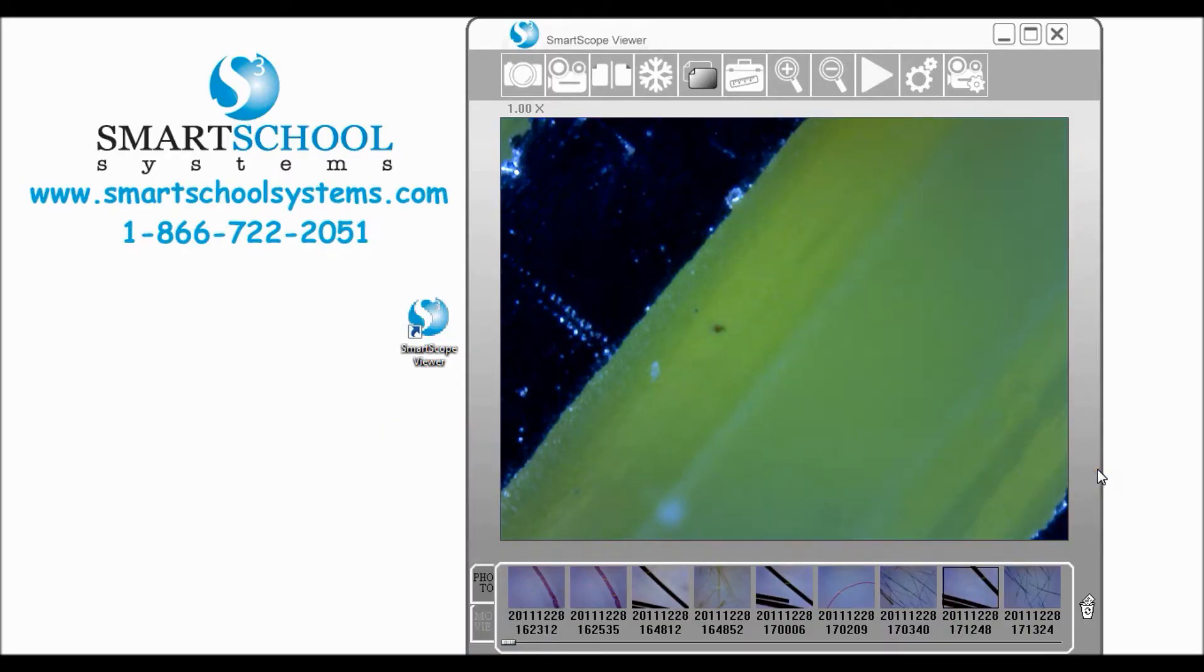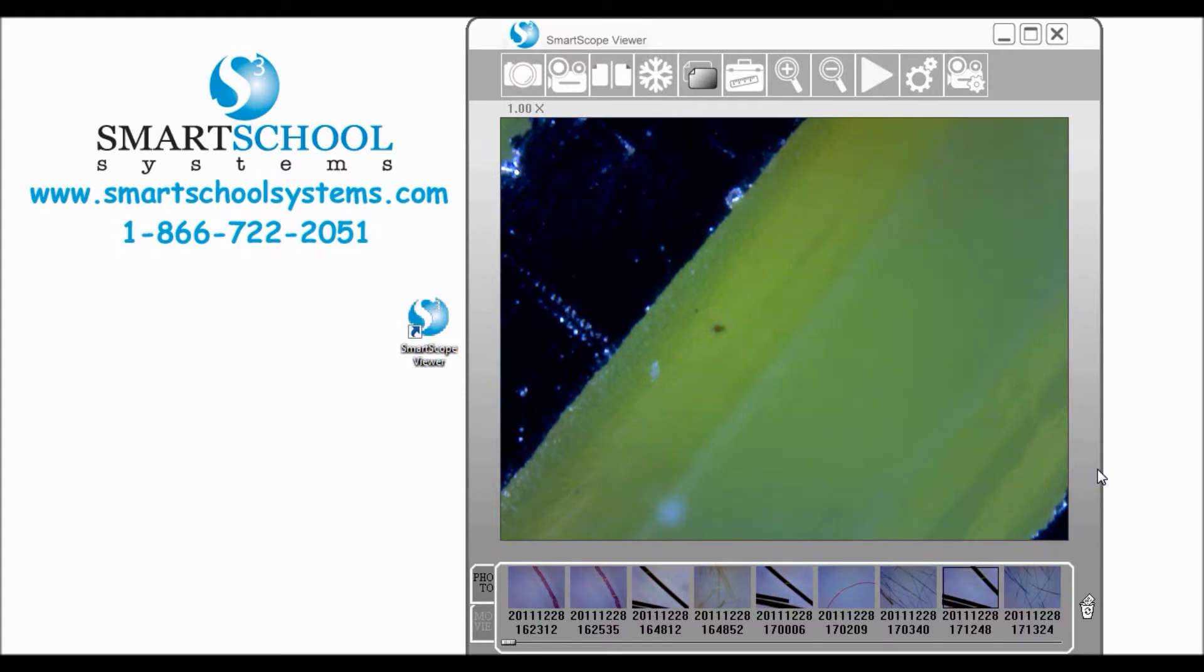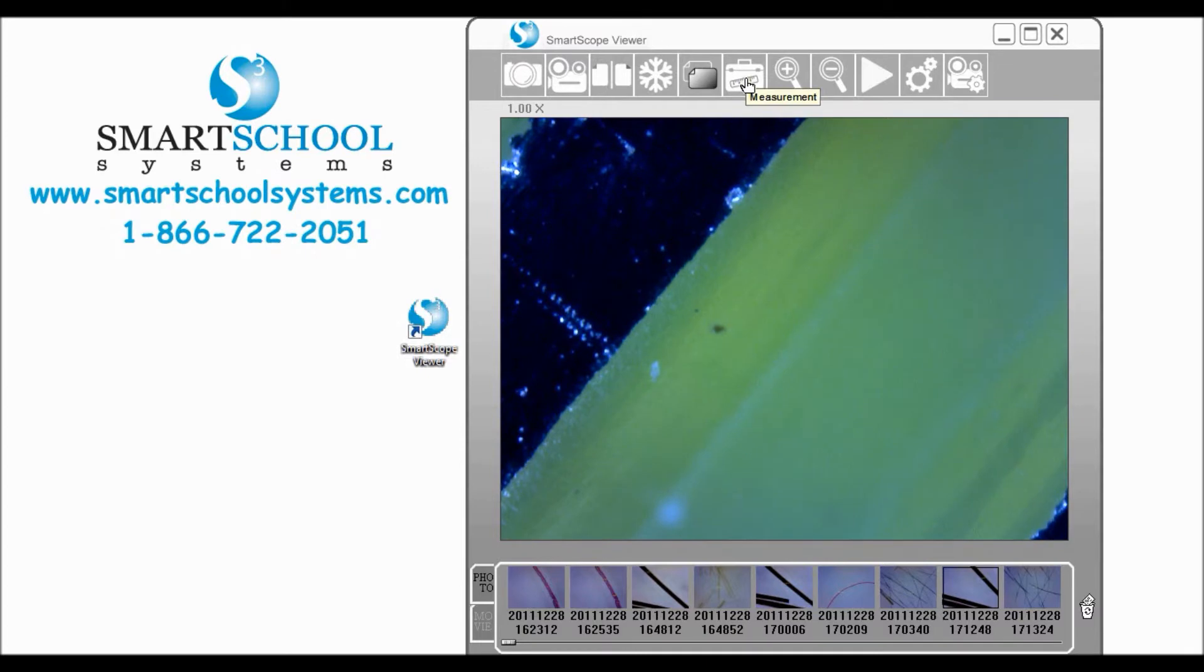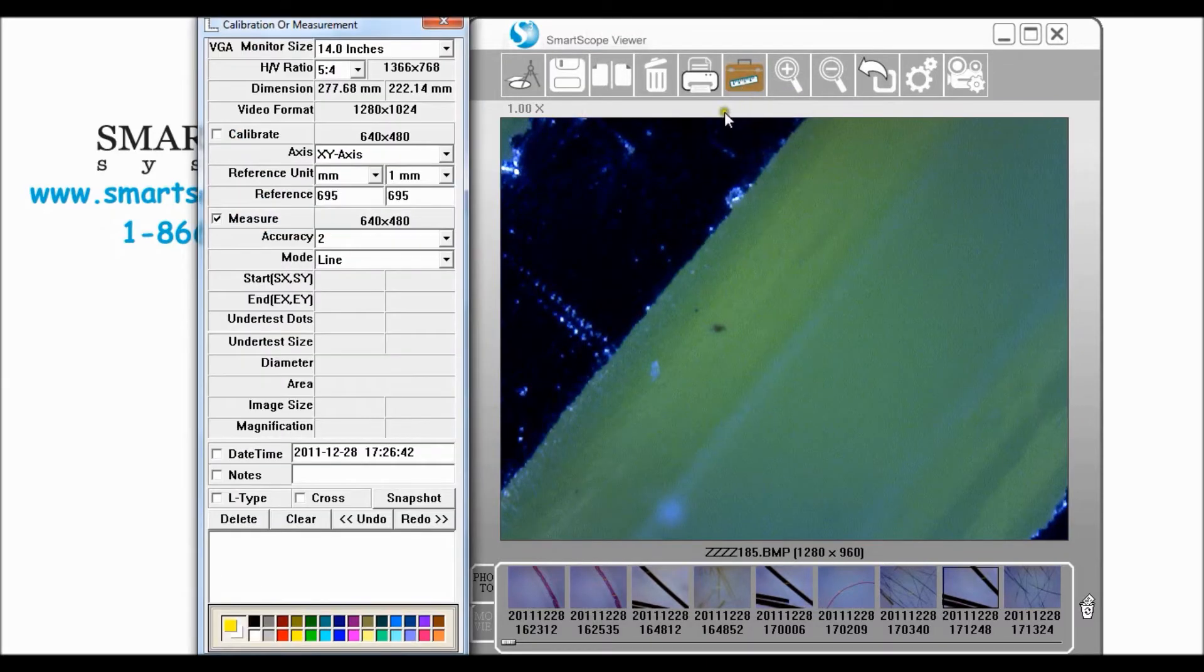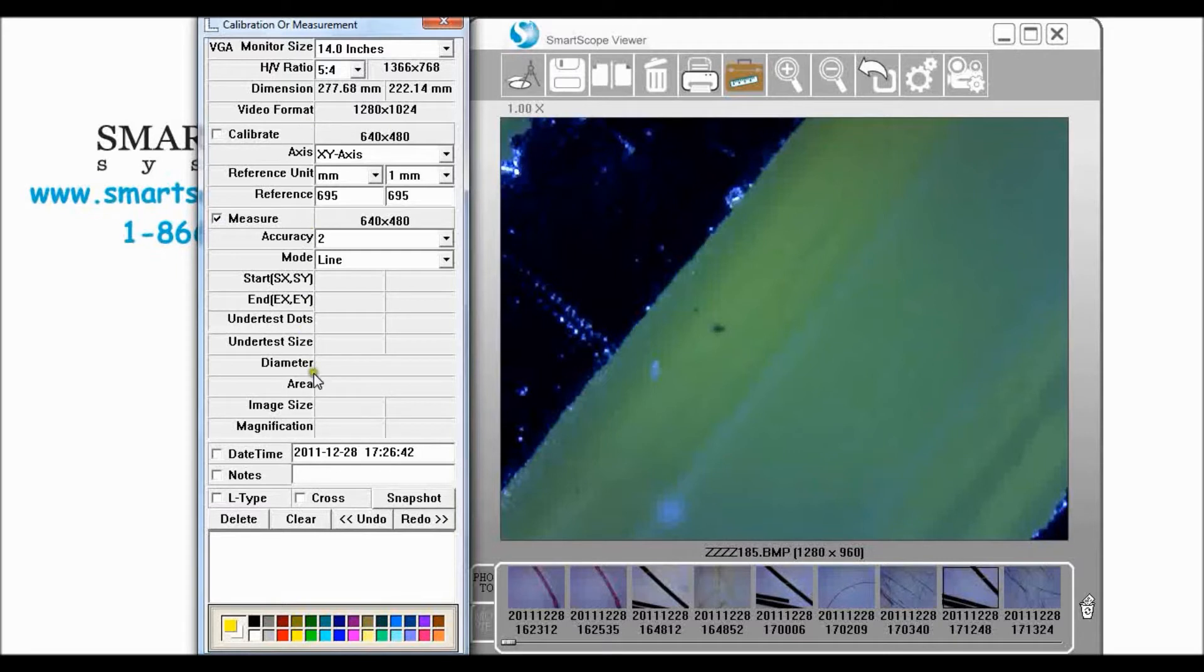One of the nice features of the SmartScope Viewer software is that you can do measurement with your SmartScope. Let's go ahead and click up here on our measurement icon and you see we have a dialog box that opens up over here on this side.